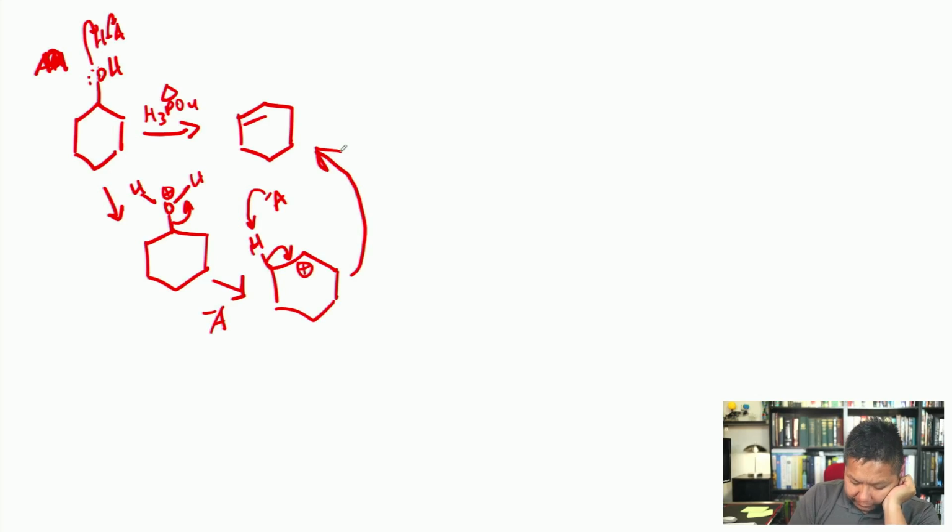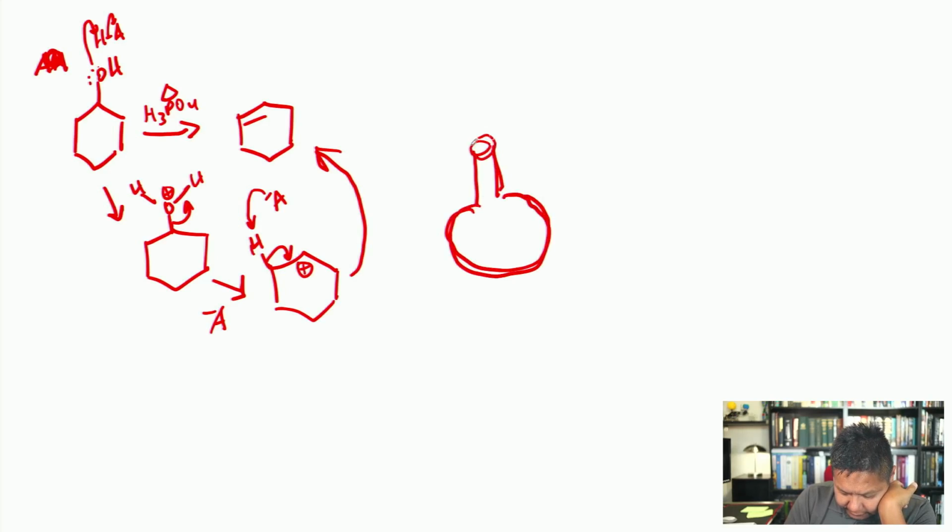The way you'll be doing it virtually is you'll have a round bottom flask. I'm never good at drawing round bottom flasks. Instead of doing a fractional distillation like you did in the previous lab, you're just going to be doing a small microscale distillation. The difference is that there won't be that much space for the gases to travel.